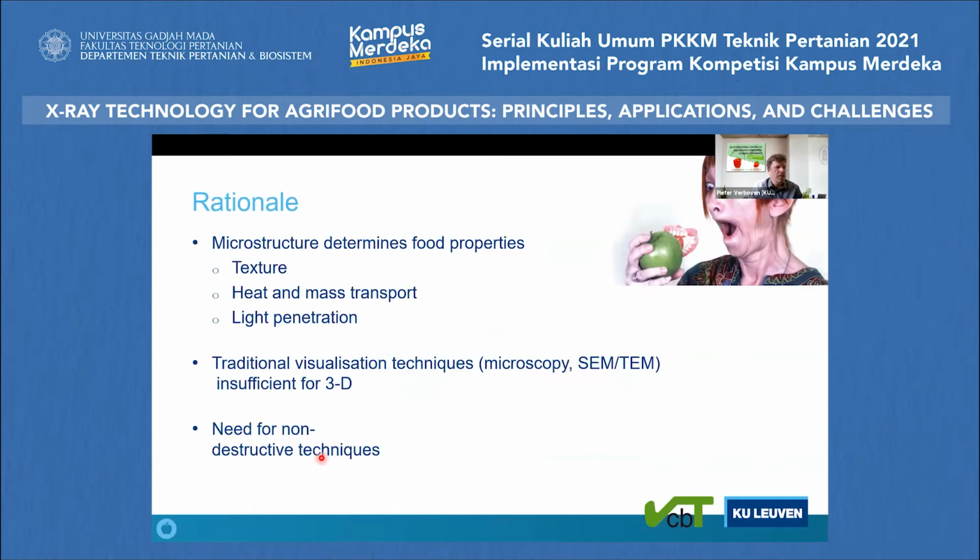And finally, a third important point in our rationale to move to these technologies is that you need non-destructive techniques. In our sector, we are producing a lot of fruit. It's not like you're producing a very fancy car where you only make a few of them a year and you sell them at very high price. You can measure their properties in very much detail, and you have a lot of time for them. But here we are producing tons of fruits, and all of these fruits need to be analyzed for their quality.